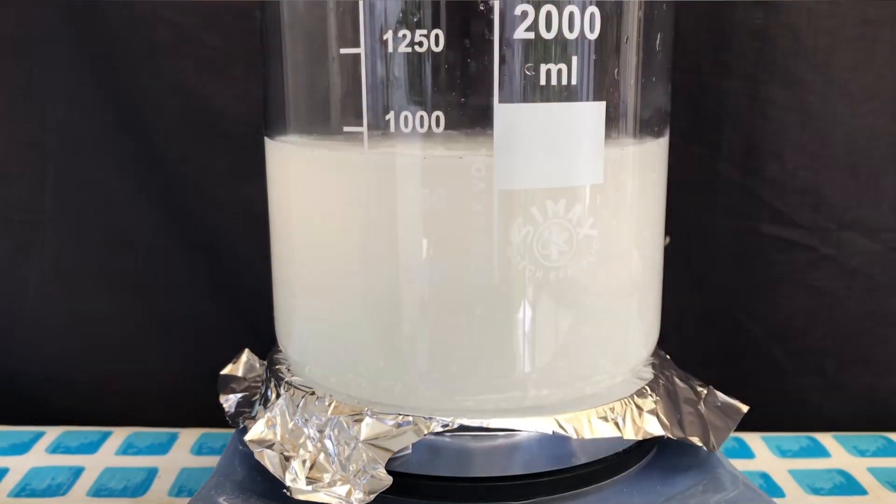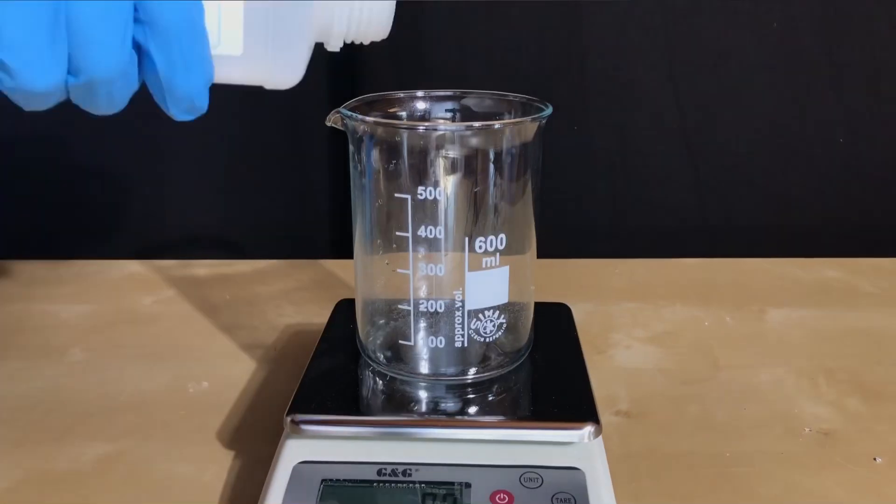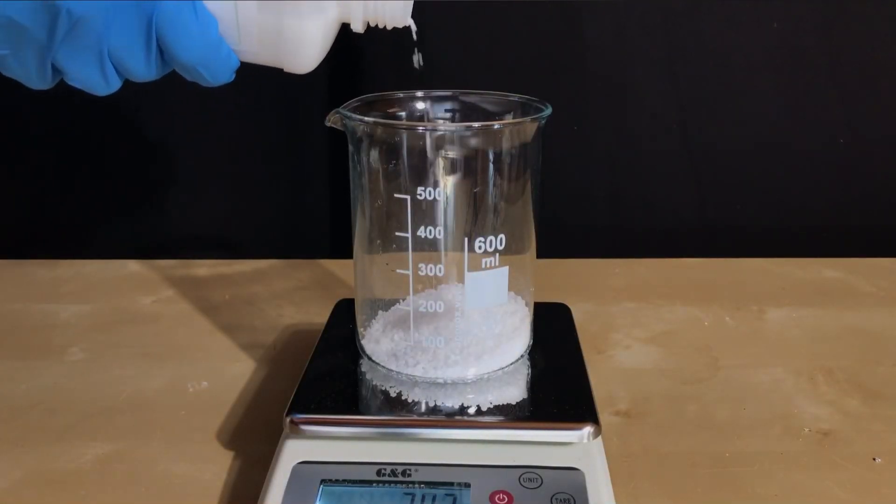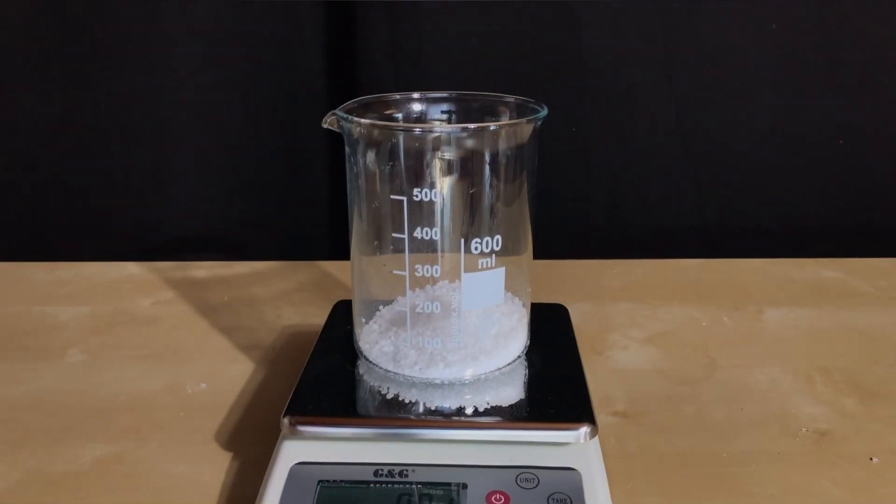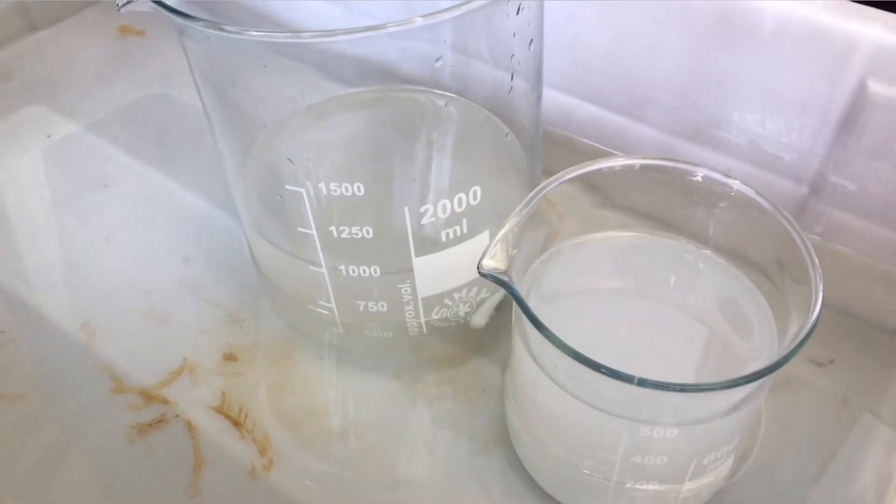Afterwards, anhydrous calcium chloride was added and we occasionally controlled the temperature by touching the glass. This way, we can avoid too much decomposition and if it gets too hot, you can simply put it into a water bath.